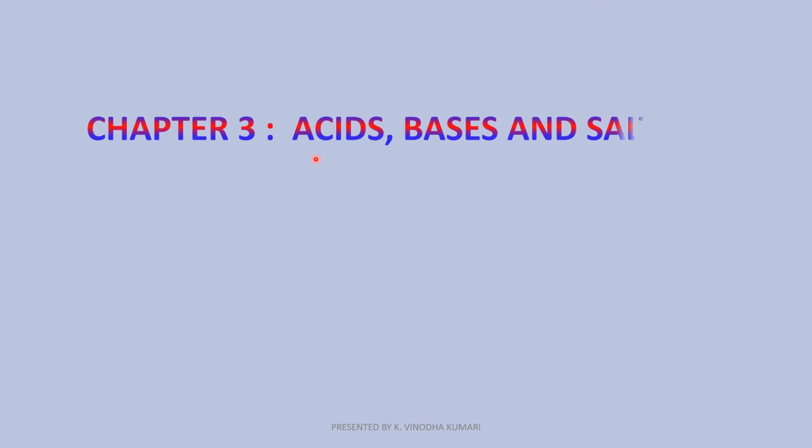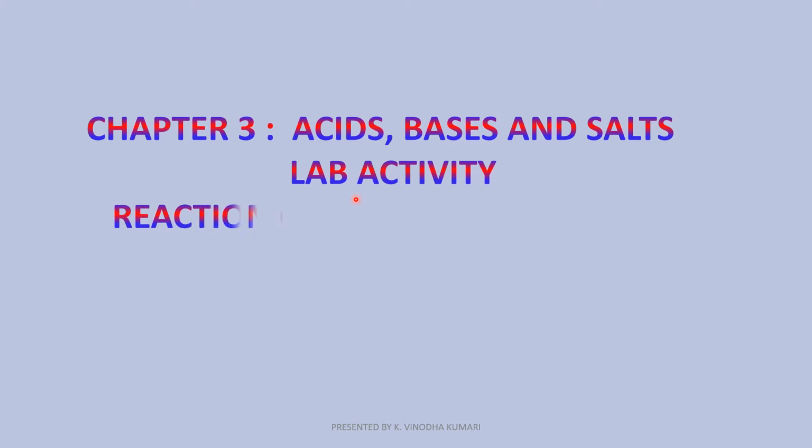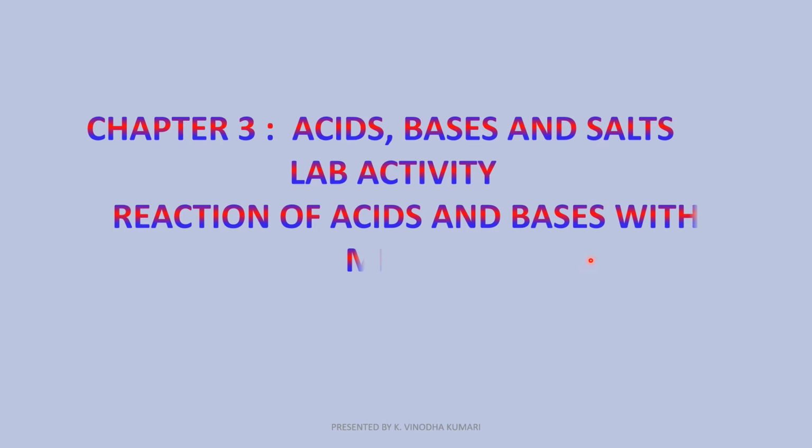Hello everyone. Today in this video, let us learn about the lab activity, that is the reaction of acids and bases with metals. This is the third chapter in 10th class, acids, bases and salts. So now we'll see the lab activity. It is the reaction of acids and bases with metals.